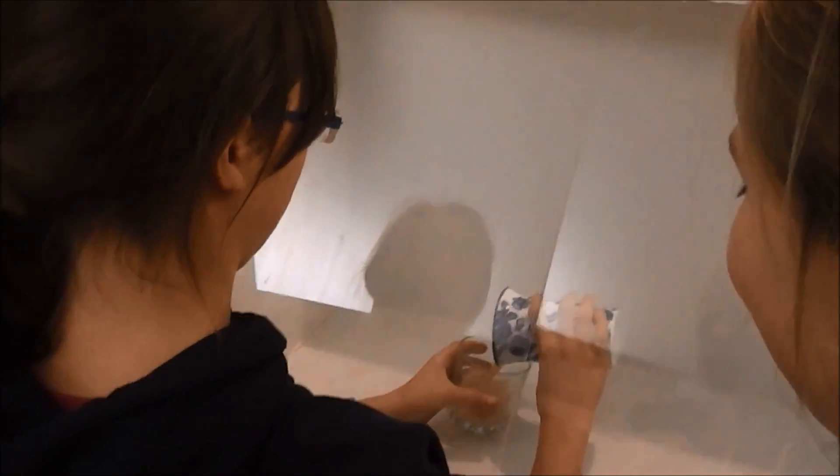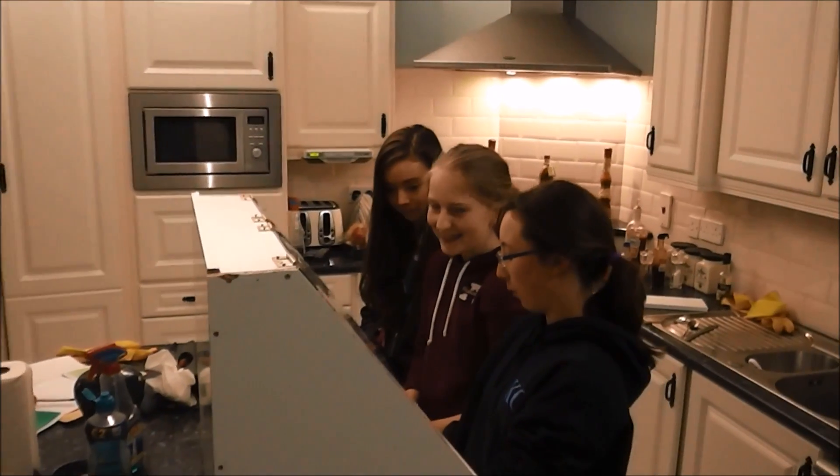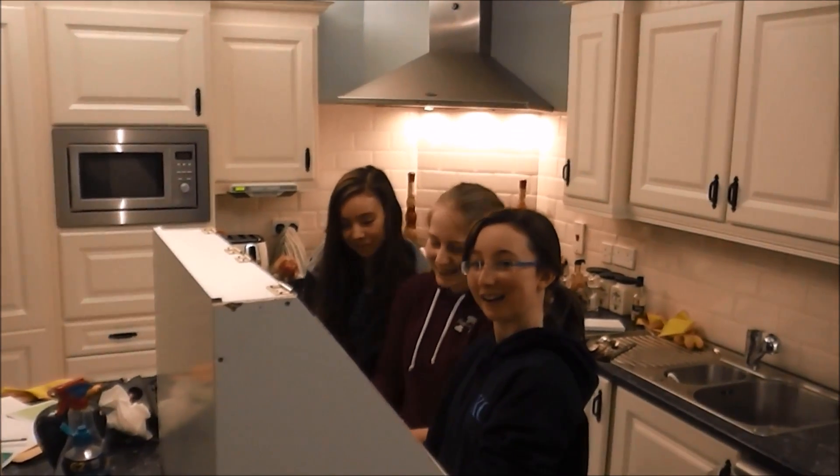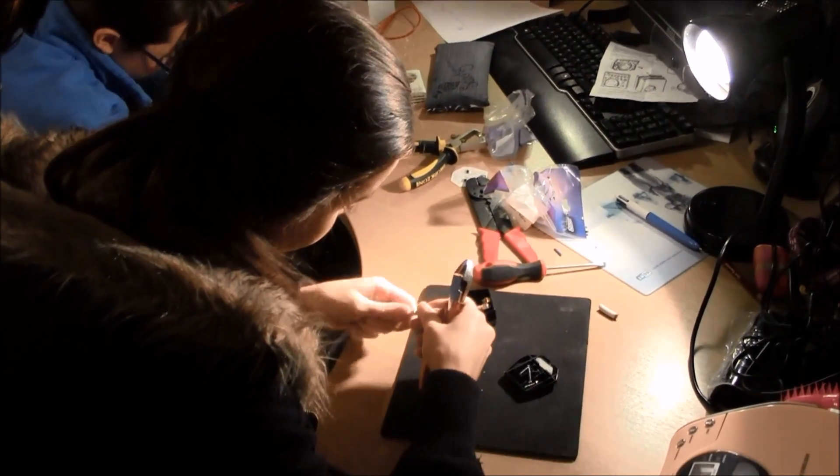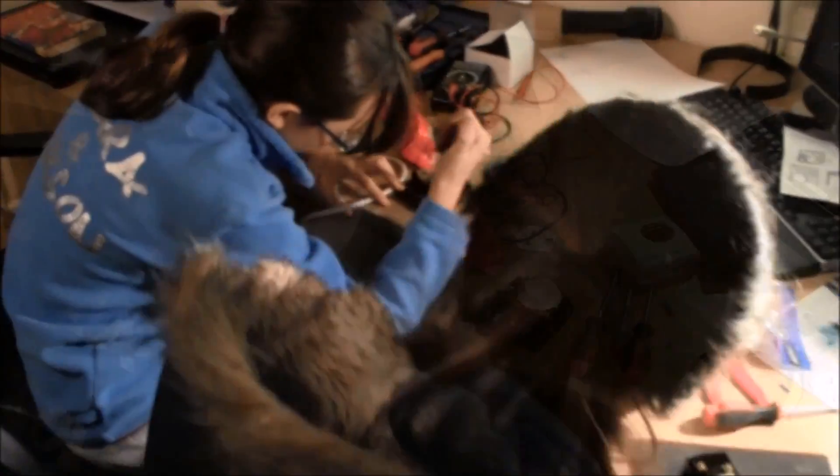We began by sourcing and building our apparatus. We built a transfer chamber and set up a lab in Ciara's spare bedroom. Using polystyrene fish boxes and thermostats, we designed our own incubators, bioreactor and shaker table.